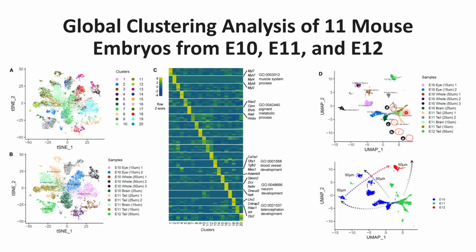Tissues have very high heterogeneity. So they further checked why these clusters are different from each other, and along with that they also see that the 50 micrometer channel's UMAP varies significantly from the early stage to the later stage. So this indicates that 50 micrometer channels have more heterogeneity at different stages, and this is also in line with the general hypothesis, as 50 micrometer channels contain more cells. So there is a high possibility that different stages of the mouse have different expressions of the genes within the cells.